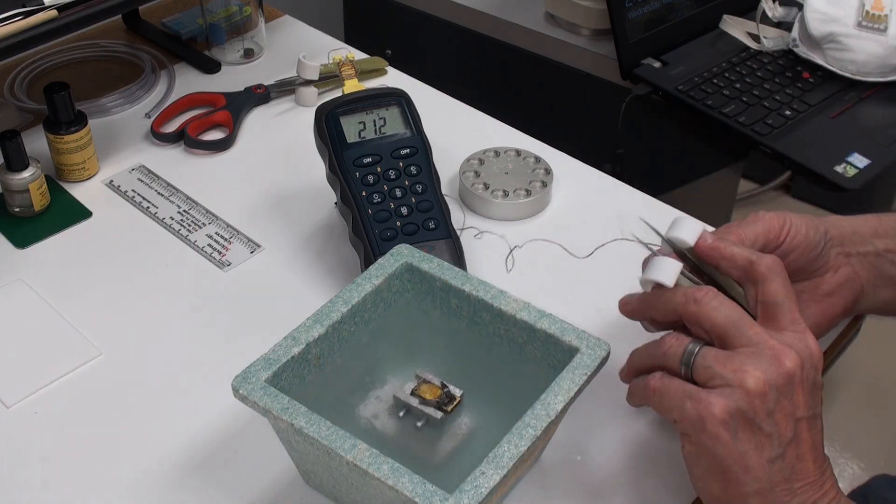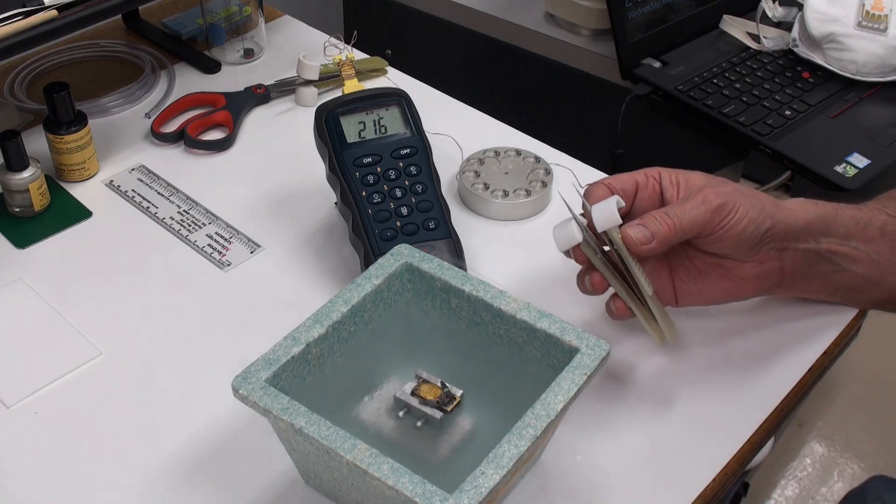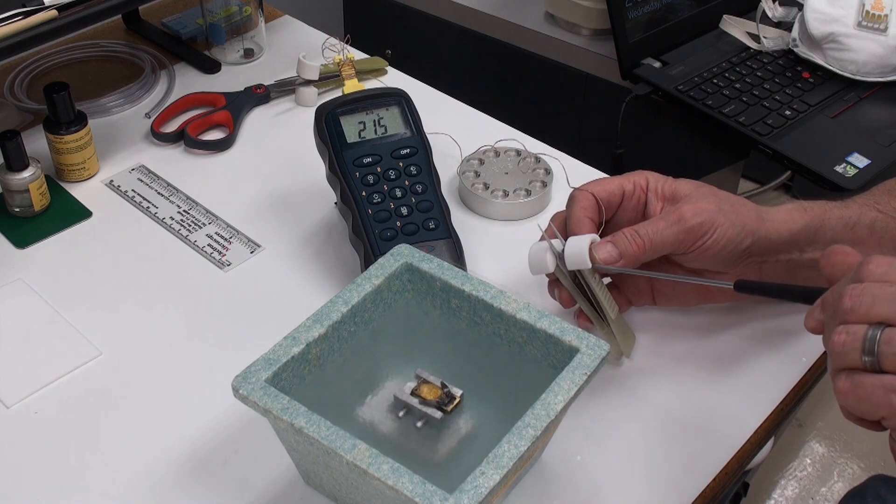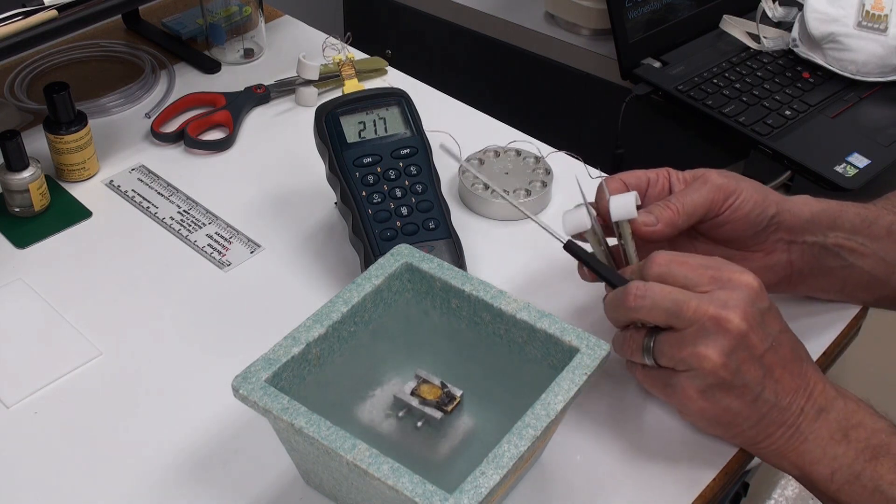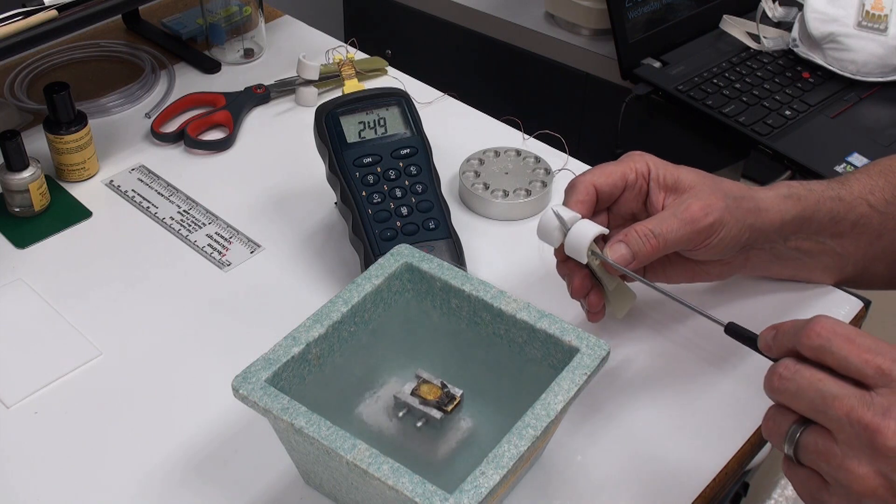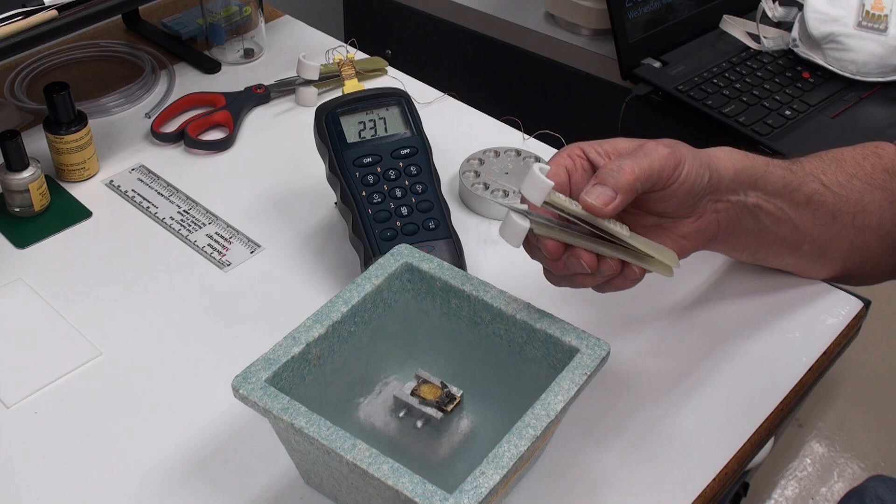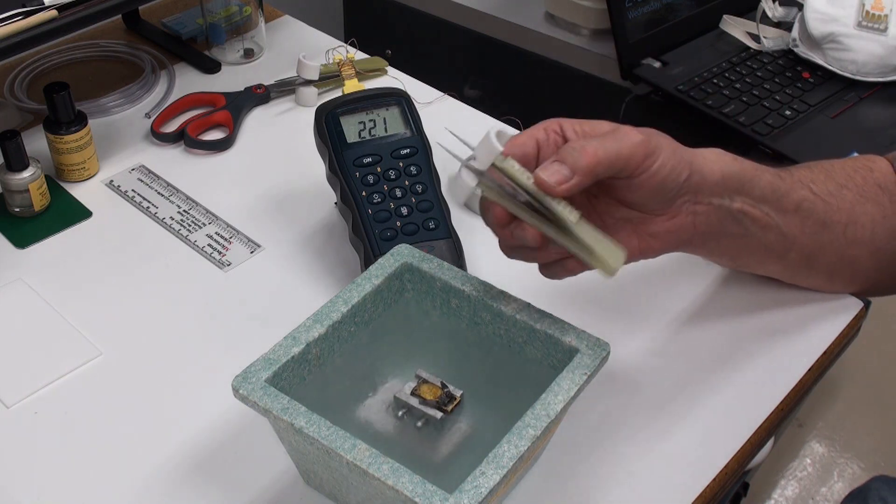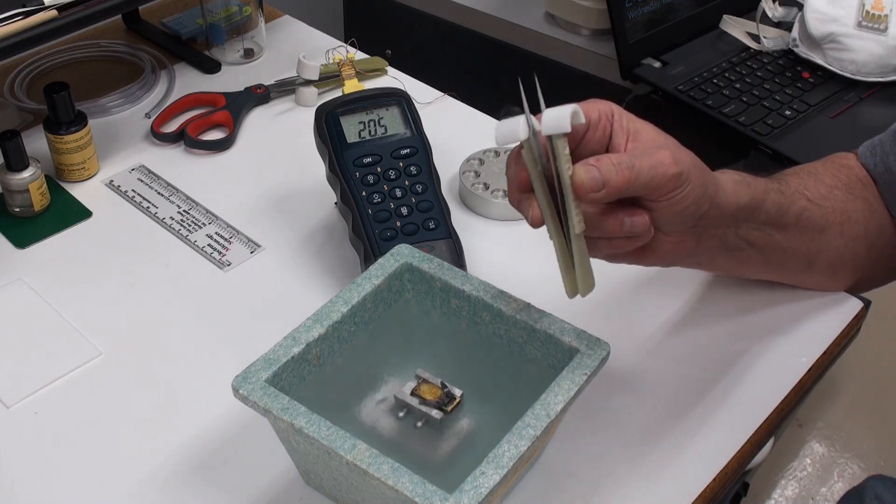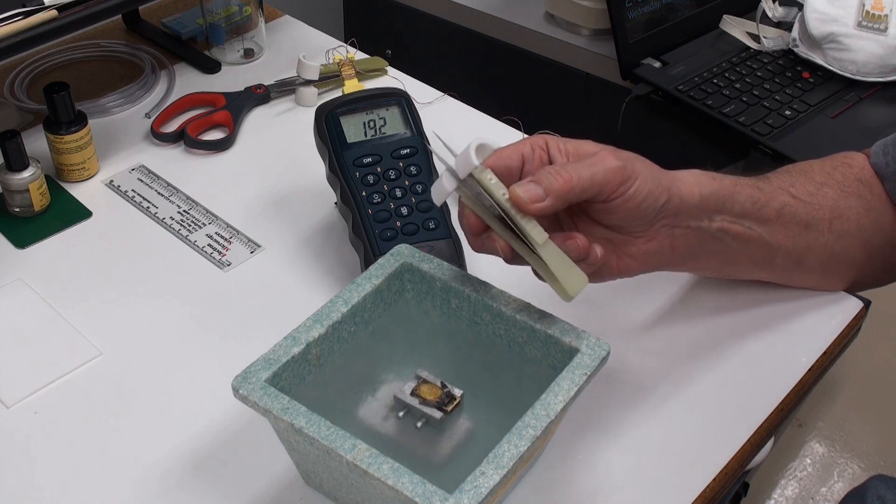The way I've designed these is, the plan is if you bend the number five tips, we can send you a rebuild kit and you can rebuild it on your own. That's what we'll do initially, we'll just send you another pair of forceps that's set up to be assembled in this fashion with some instructions.